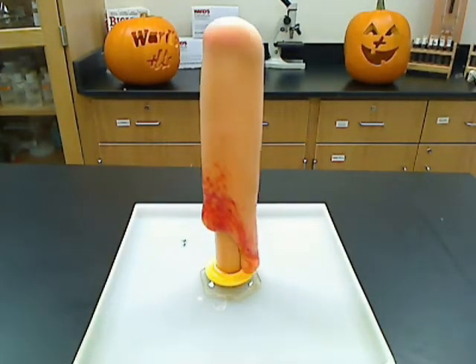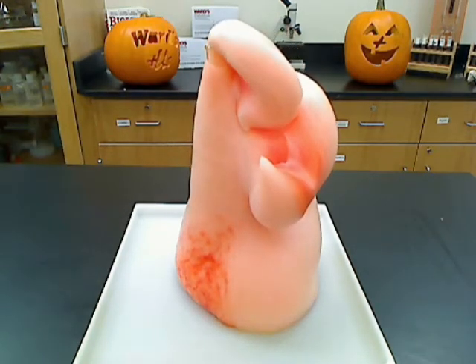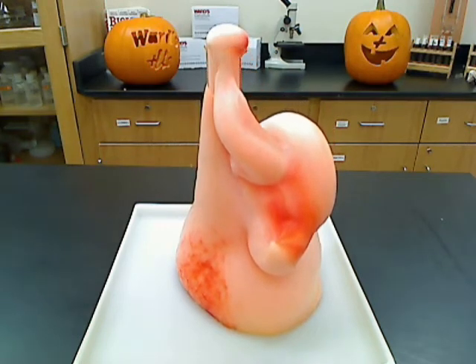As you can see, foam is beginning to form. This shows that the hydrogen peroxide is decomposing into water and oxygen gas, which gets trapped in the foam bubbles.